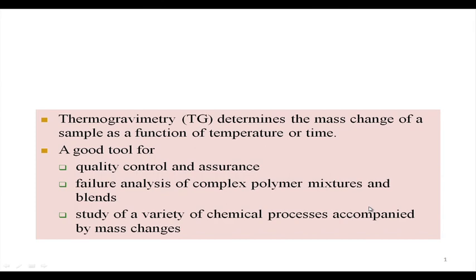So, if we have a polymer mixture and blends also. Polymeric samples, just now I told you also that we can handle nicely with this particular technique. So, if we have polymer mixtures and blends, their thermal stability is also very important, because at that particular temperature, whether we are using below 50 degree centigrade or we are using that particular sample for the car component, because the car engines and body and all these things have some variable power consumption as well as the temperature rise for all these components.